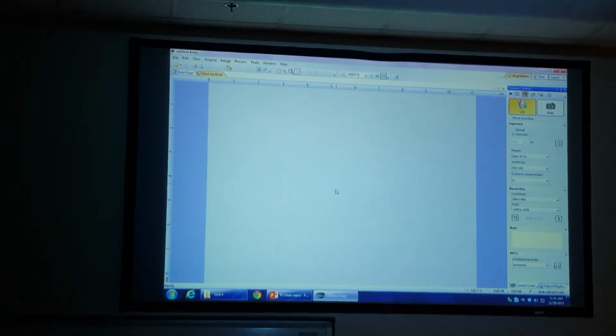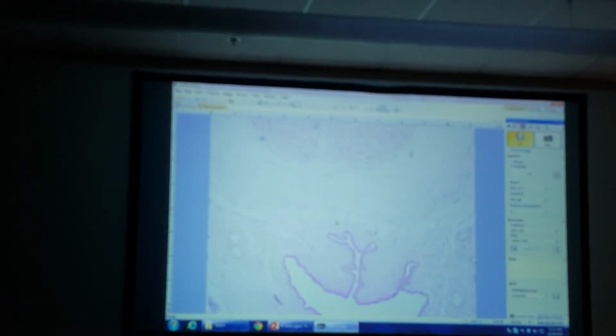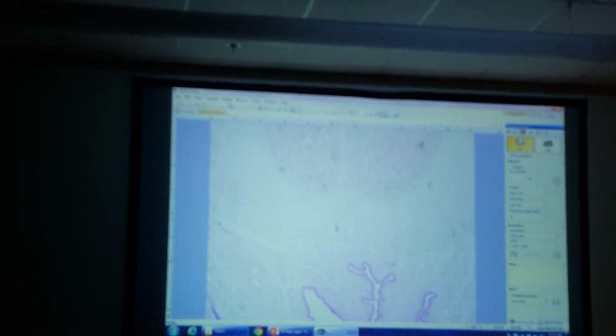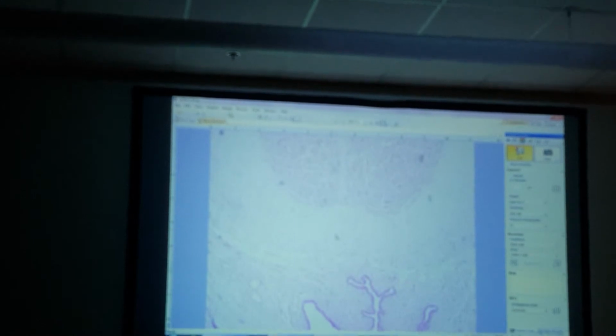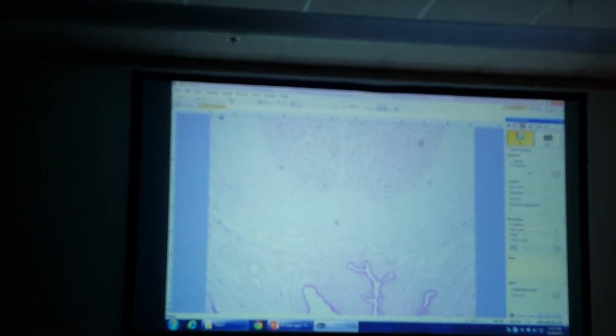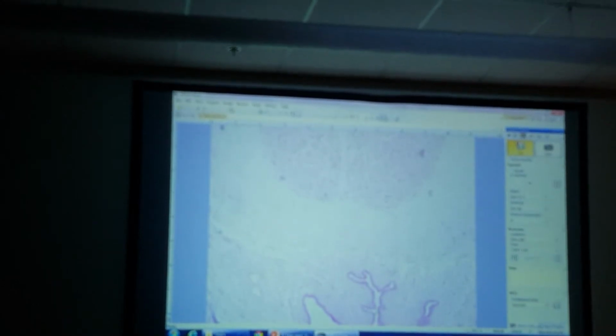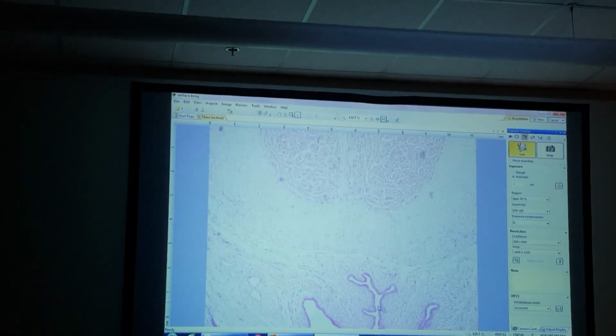And then the section of the penis. This is on low power. On your scopes, you'll be able to see a little bit more than I can see on here, because again, we get extra magnification. But even at low power right here, I can see the lumen. To me, that's the easiest part to get oriented to. Find the lumen first.